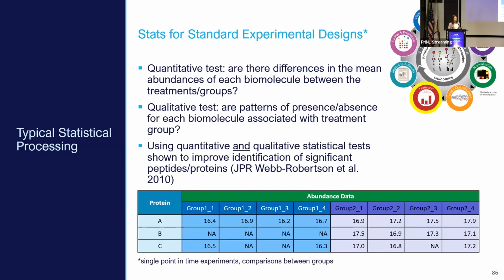So once we have gotten our data to the protein level, we are finally ready to make our statistical comparisons and find out which protein might explain some of the differences that we're seeing between experimental groups. These tests that I will talk about are things that you heard about yesterday as well. So hopefully they're familiar to you a little bit from that, if not from prior.